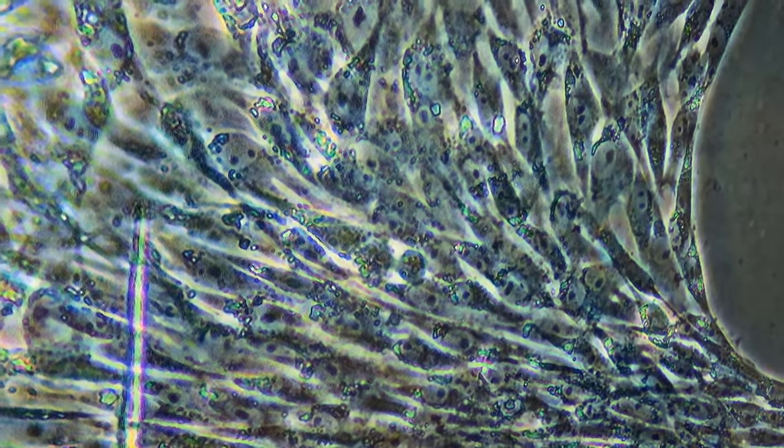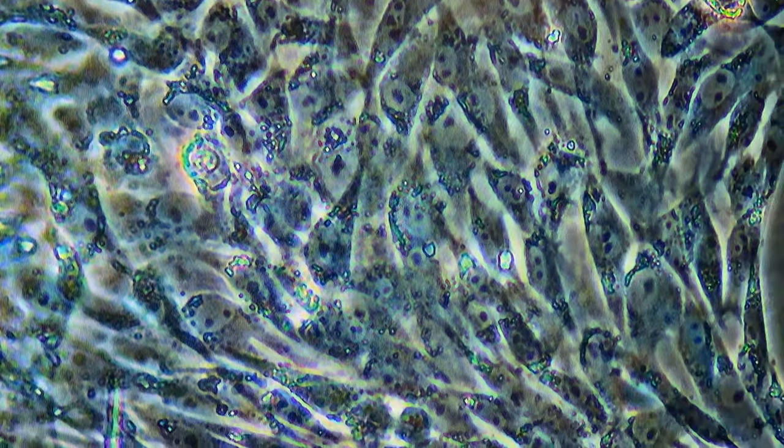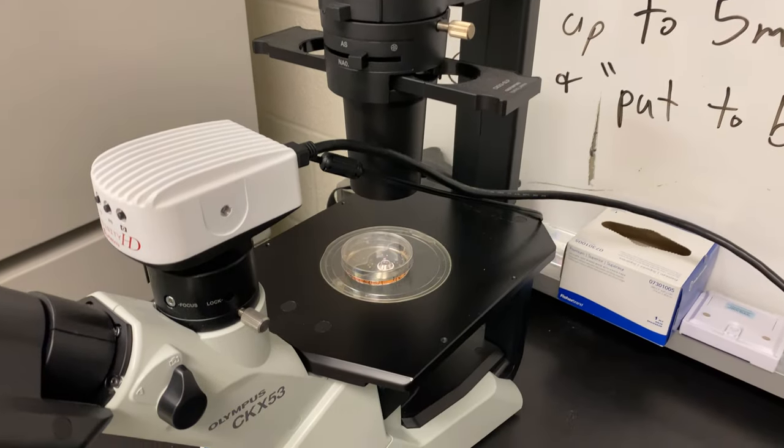Zooming in at medium magnification, you can see the explant and the cells a bit better, and you can start to see nuclei here. At high magnification, now only time will tell if this will become a continuous cell line. These cells are senescent and may not survive after a couple of days. If the cells do not transform, they will all die — that's the nature of primary culture. It's not as easy as it looks.